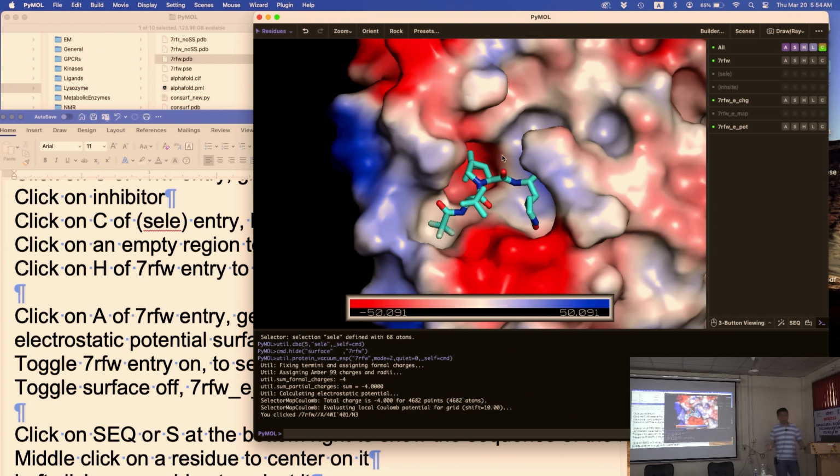How to make a video of this? If you don't rotate, there's no video. It's a 2D stationary structure. I'll show you how to make movies. So I'll show you how to do that. Yeah, that's the last part. We only got an hour in. We have plenty of time. We'll be here for another 2 hours, 3 hours.